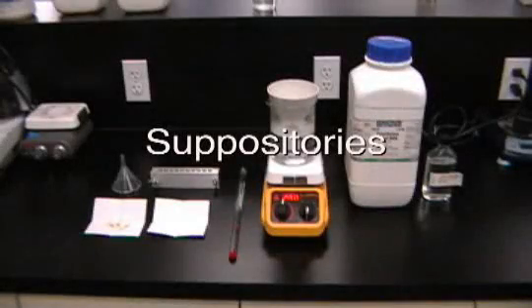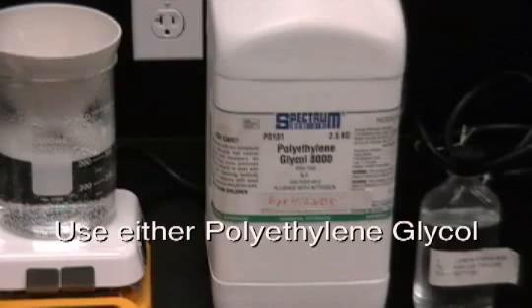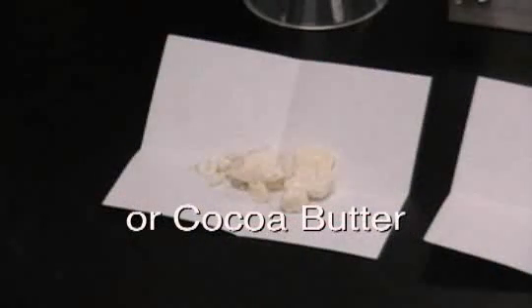Today we'll be making suppositories in lab. Your suppositories are either going to be made out of polyethylene glycol or cocoa butter. You will be making both, by the way.